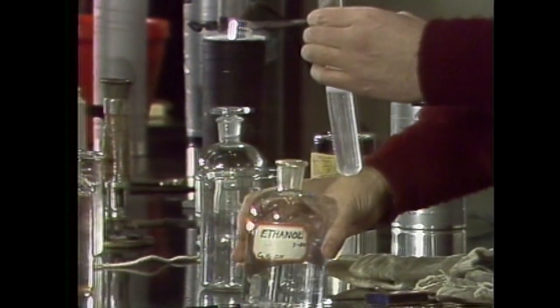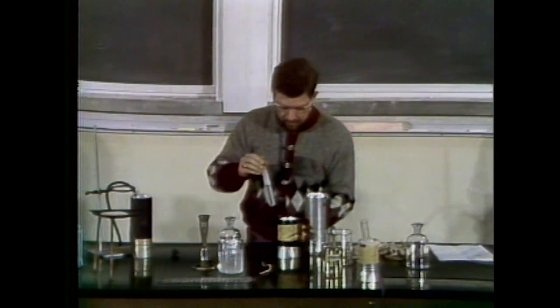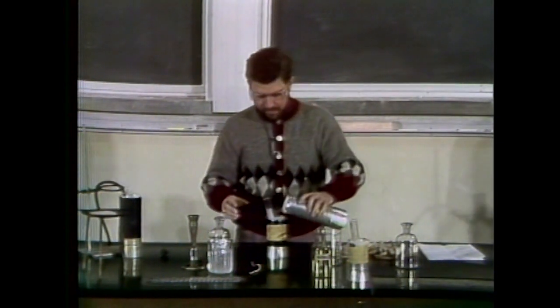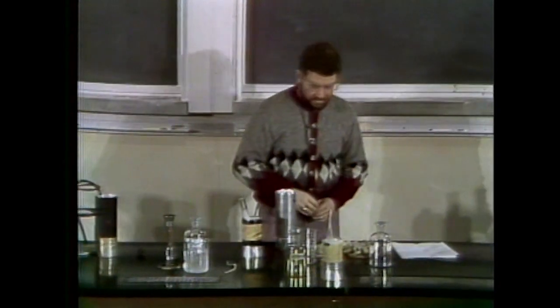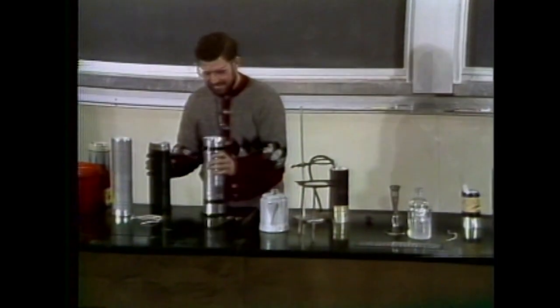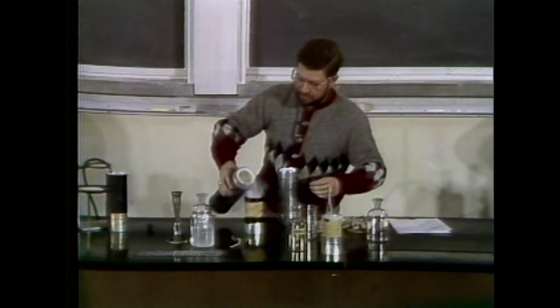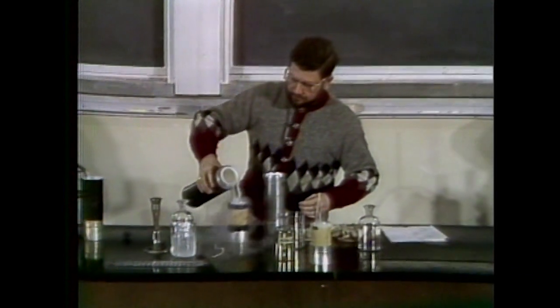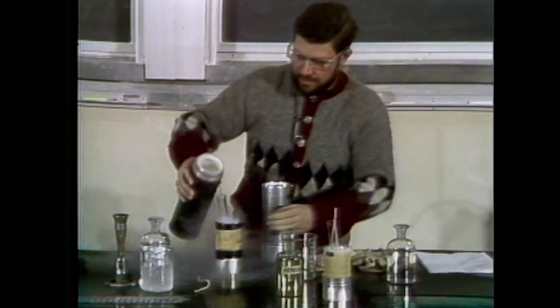You see, it's a very useful compound. It has many uses that I'm sure you're familiar with. It's used as an antifreeze in one form or another. So we'll let this cool for a while now here.